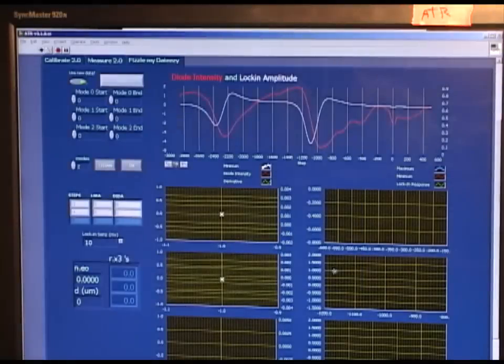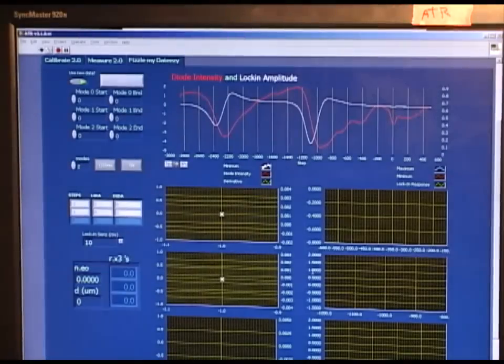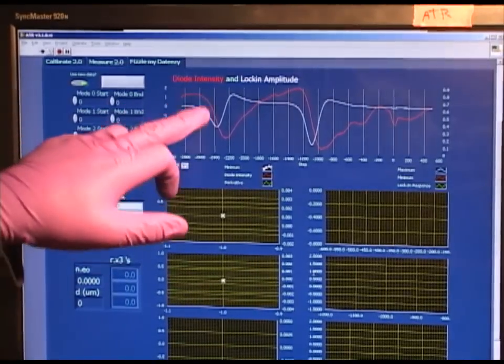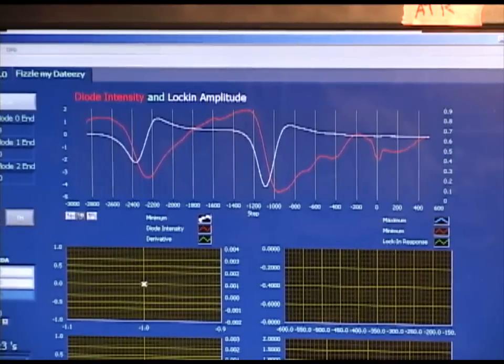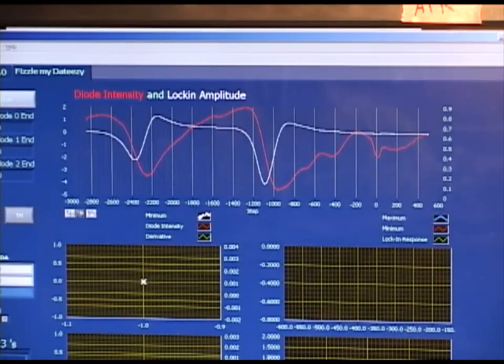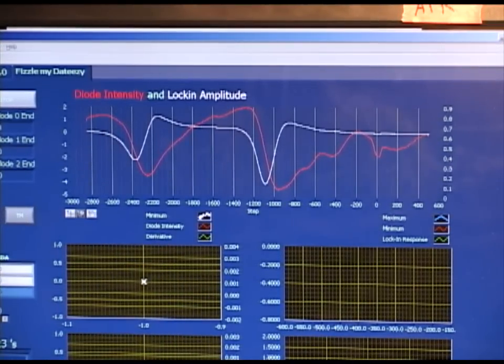When we open the data tab, we select the data that we have just taken based on the information we entered. We then see a printout of the diode intensity and lock-in amplitude here. These dips correspond to modes. From the amplitude of these modes, we can determine the R33, the thickness, and the refractive index of this particular material. It is important to note that if there are less than two modes, we must enter a thickness which we have previously determined, as thickness can only be determined from the modes if there are multiple modes.